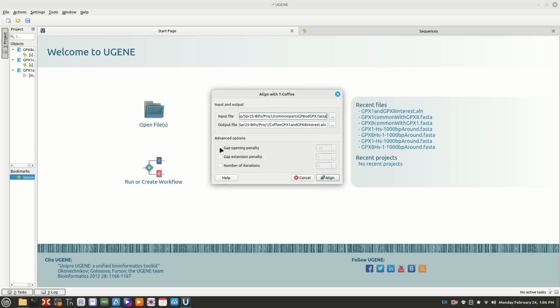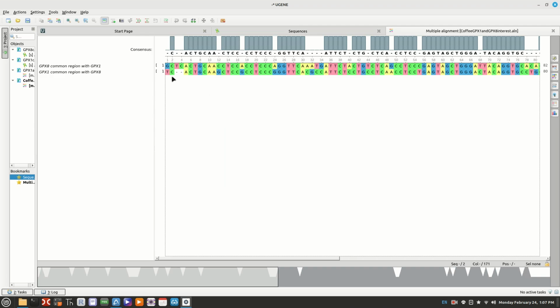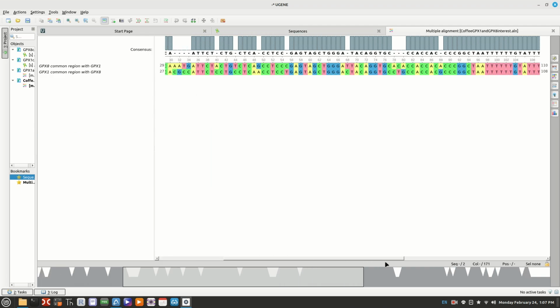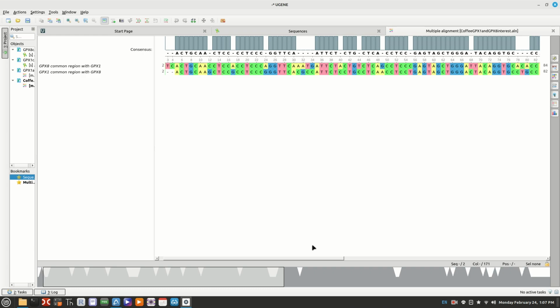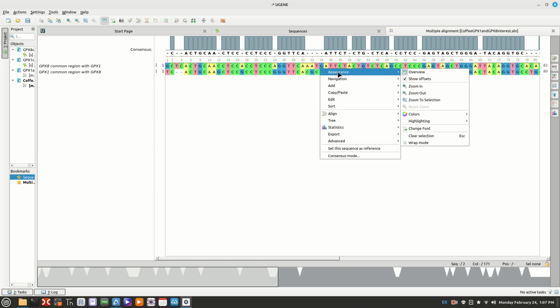And now here we can put all kinds of parameters to change how this works, but I'm just going to align it and see if it does anything different than the other one. It did. Alright, I think this one is slightly superior. So let's go ahead and save this one. I'm going to ask you to do it with at least 3 of the programs there. That makes sense. So here we go. Because this is looking like you need to.